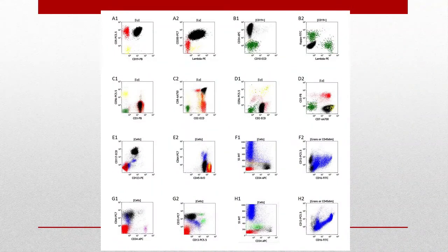Here we have, in D, a T-cell leukemia that expresses uniform CD7, bright CD2, and does not express CD3, so surface CD3 negative. E shows an AML that's dim CD45, you can see it here, has dim or some CD123 and 117 positive.